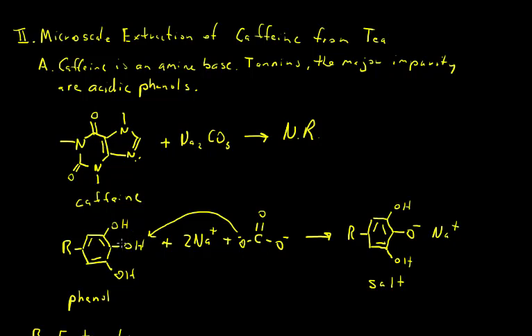So instead of adding an acid, we're going to add a base to this solution. So what's the base going to do? Well, the base doesn't react with the free amine caffeine, so there's no reaction. But we know that the sodium carbonate, or base, will deprotonate the acidic phenols. So any one of these three protons could come off, probably more than one comes off. I'll just show it with one of them.